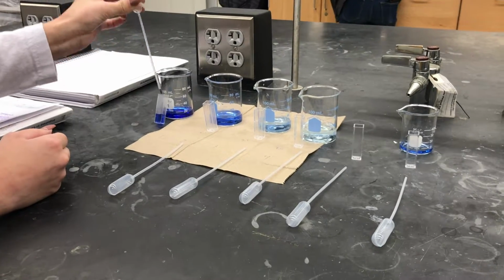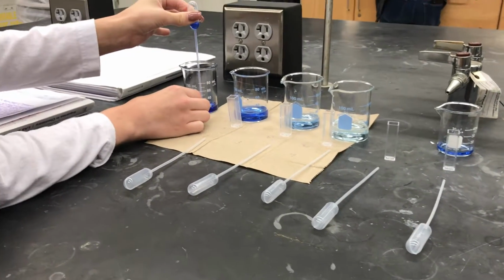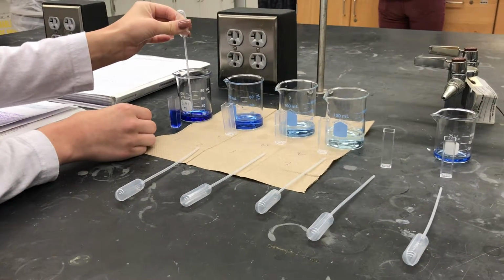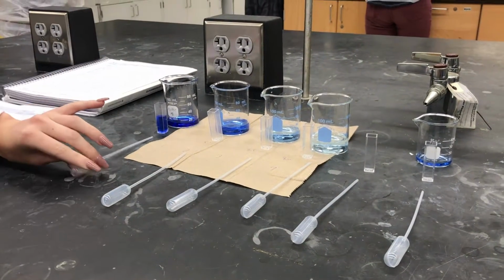After all serial dilutions are made, transfer each into the cuvette using the pipette, paying close attention not to pass the line.